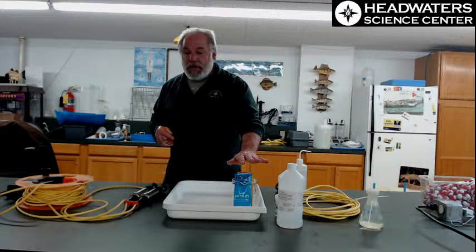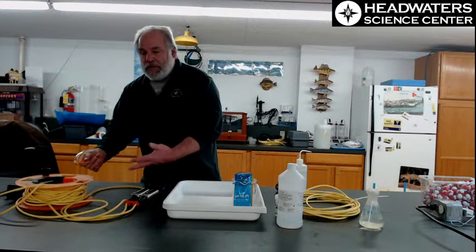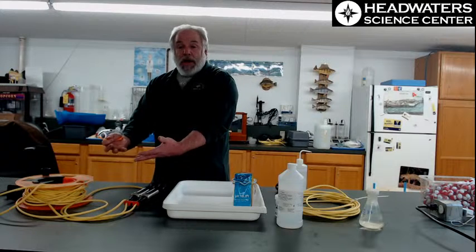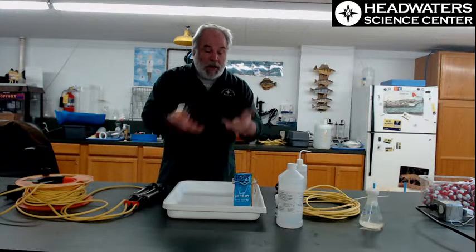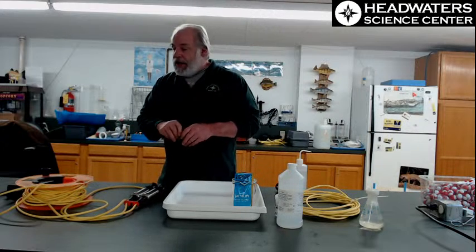We care about pH for other reasons than whether it's in that range, because different chemistry acts differently. It reacts differently under different pHs. Some things precipitate out of the water at higher pHs. Some things dissolve into the water at lower pHs. So we want to keep that pH in a reasonable range.